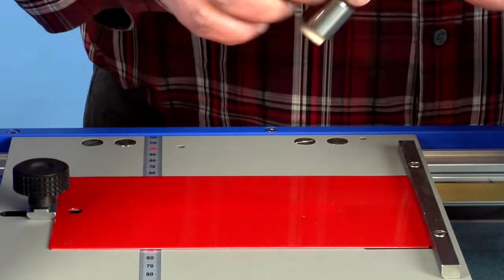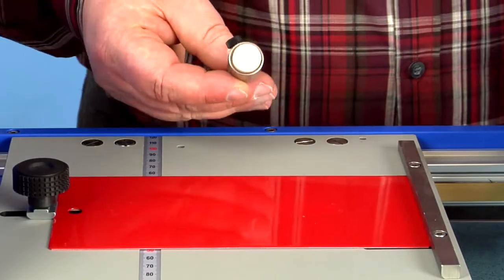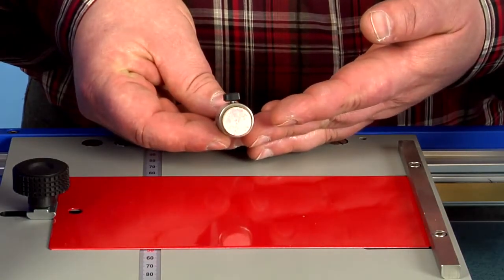A distinct impact of the solvent on the tested surface is visible, as well as a colour transfer to the felt plug.